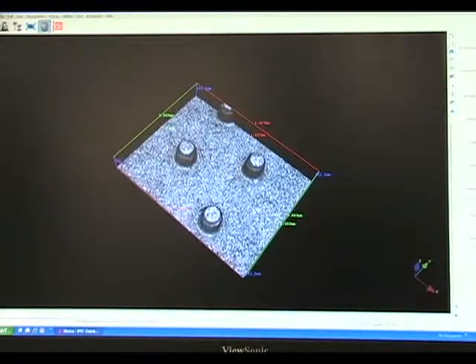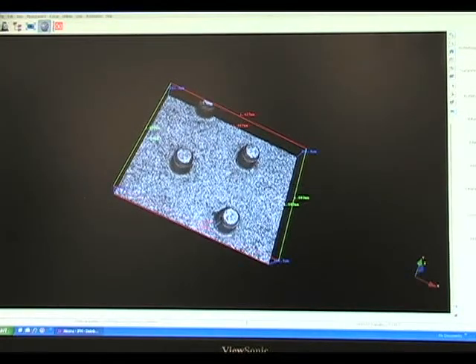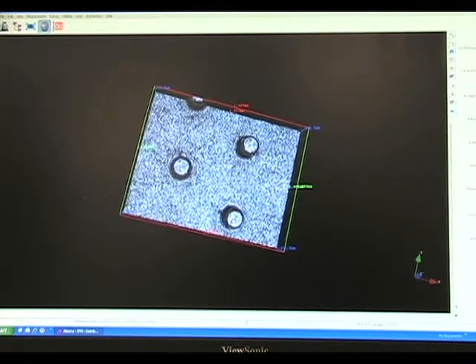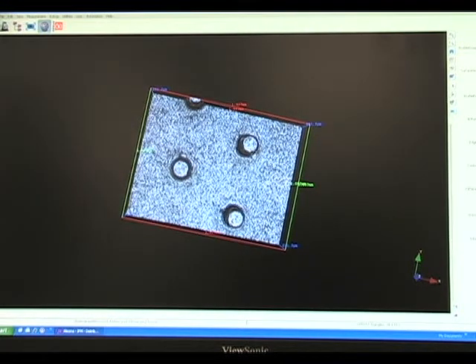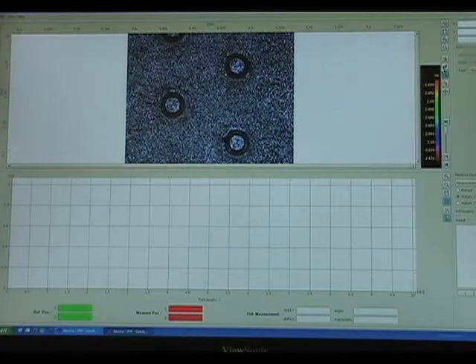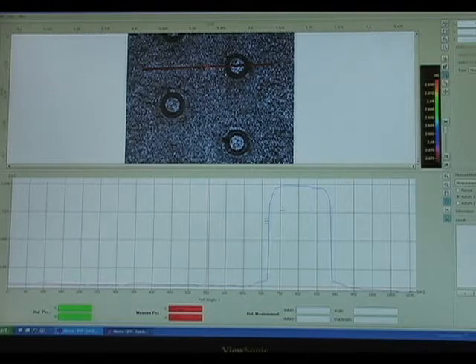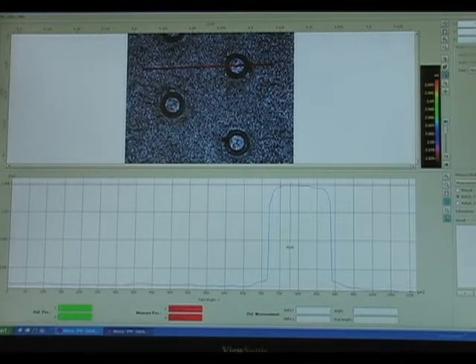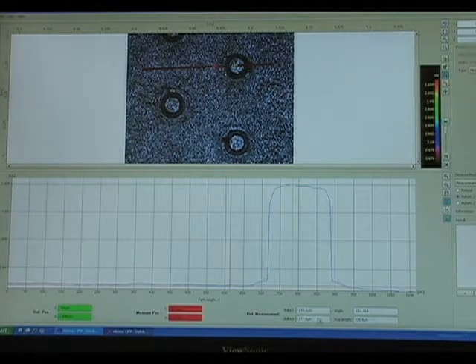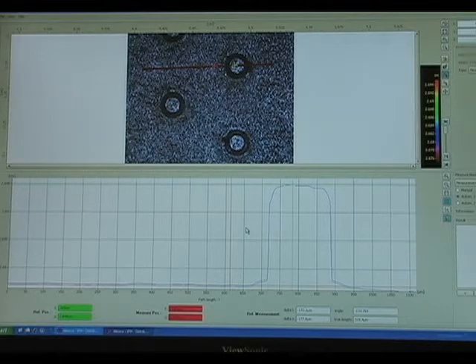There is a 3D model. Now that we have that 3D model, the main purpose of the software is to actually measure. For example, if we simply wish to measure the Z height of one of those shapes, we click on profile form measurement, draw a line from there to there, and here we have the profile. We can now accurately measure the Z height, and we can also clearly measure length, width, radius, and all other two-dimensional measurements.